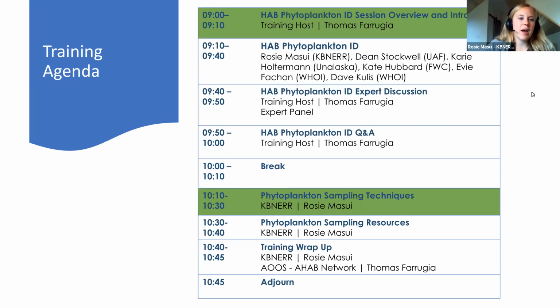All right. So now looking at the training agenda, just wanted to give you guys an overview of what to expect for today. So going to do a quick overview and introduction. Thomas is going to lead that. And then we'll get into some harmful algal bloom phytoplankton identification overview. Thomas will do the introductions when we get there. There will be some time for expert discussion and Q&A. So feel free, if you have questions as they pop up, to enter them into the chat as they're coming to you, but we will address all of them when we get to the Q&A, just so that we have enough time to work through those different presentations.